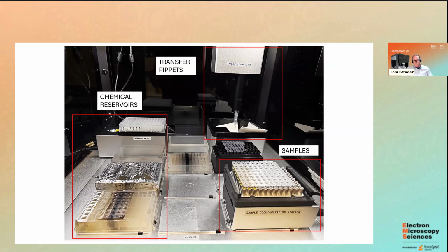And there is one more option that some people are doing, which is just putting their ethanol in the osmium, and that does the deactivation for you as well.